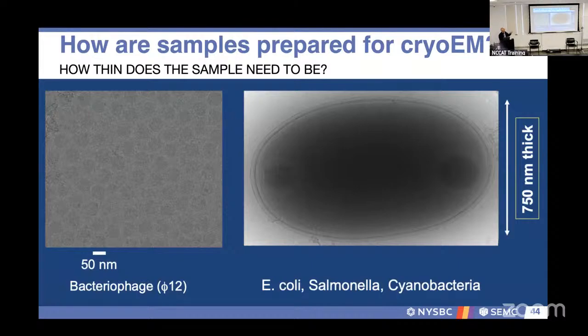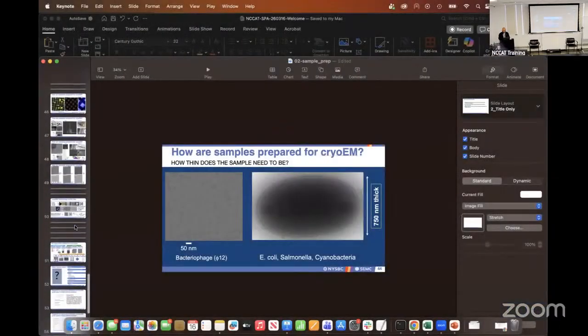It's just that in terms of the standard sample prep, we wouldn't normally do that because the amount of information we get is quite low. And even if you're dealing with phages that are on the order just shy of 100 nanometers or even 50 nanometers in diameter, there can be quite a loss in terms of the information you can get using single particle methods.